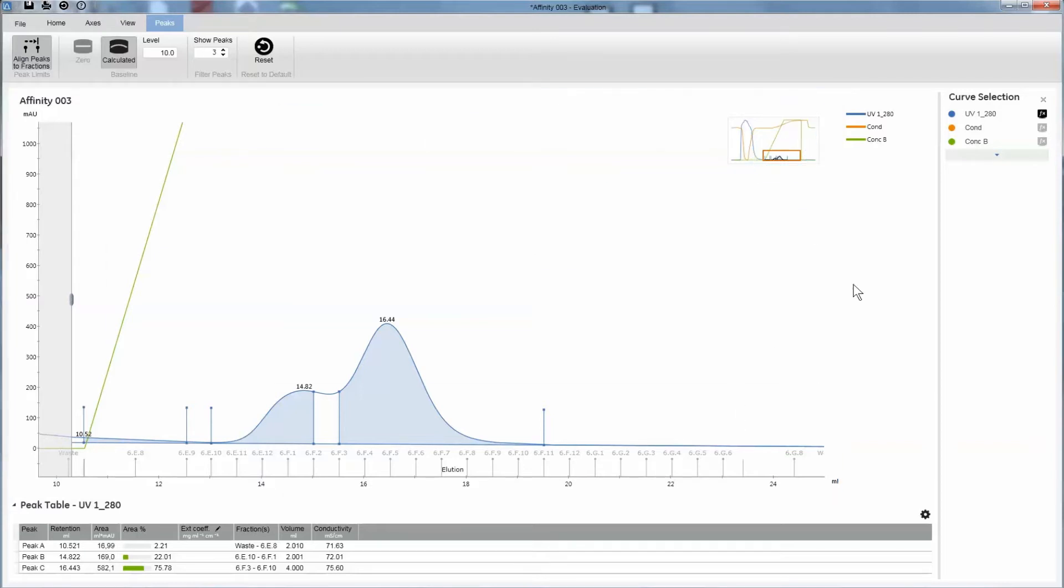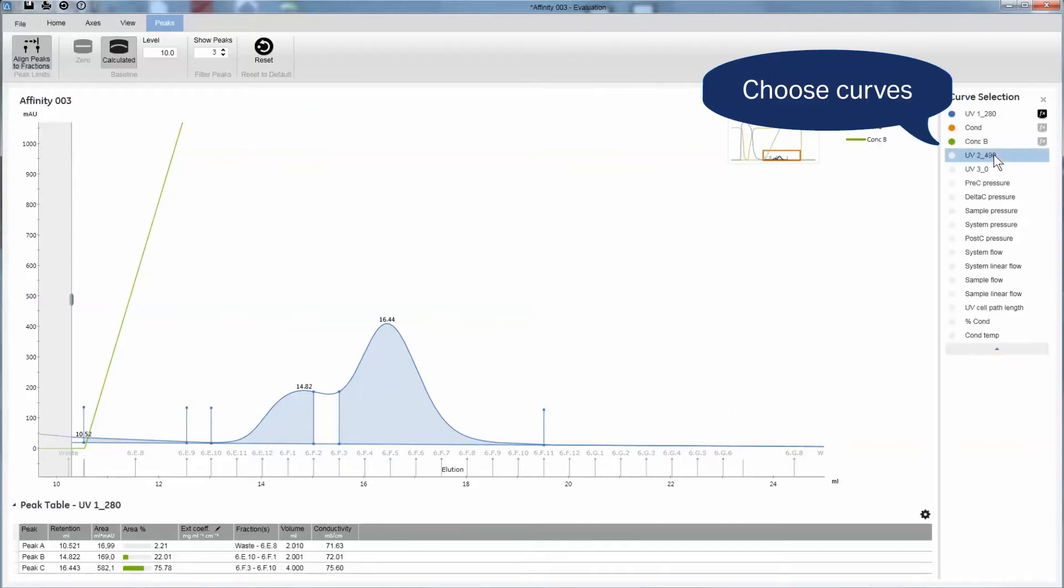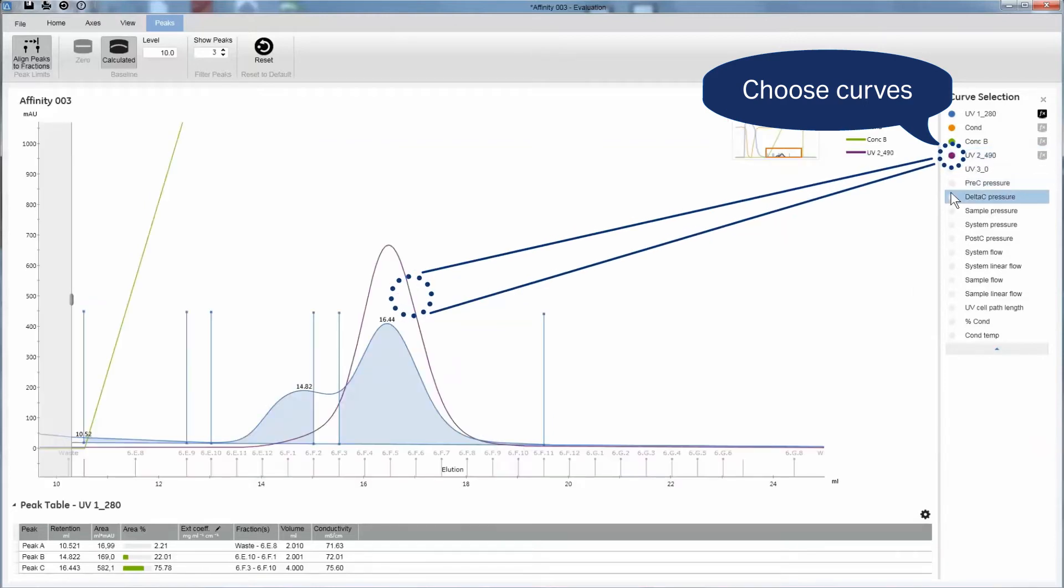You can display additional curves like UV2, pH, and pressure. This run included a second UV curve. It can be used to identify your target.